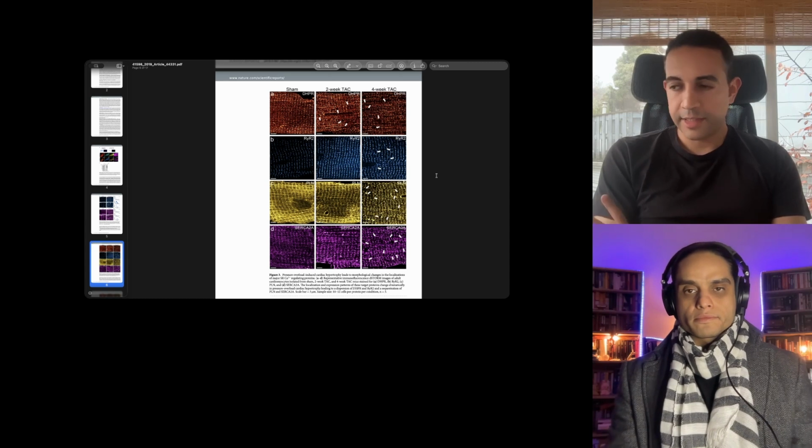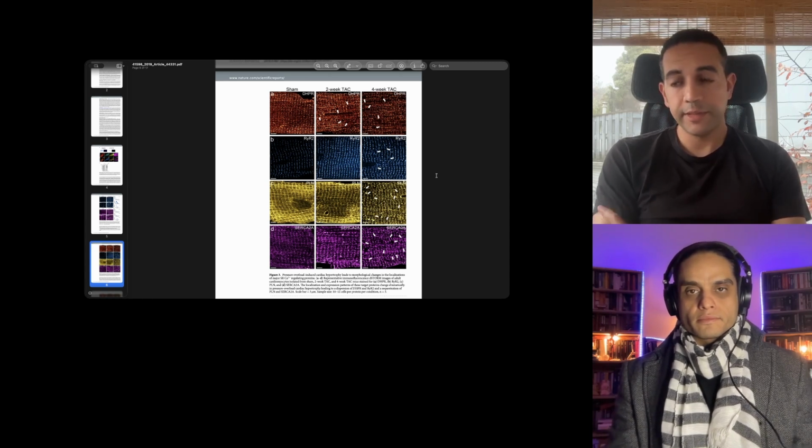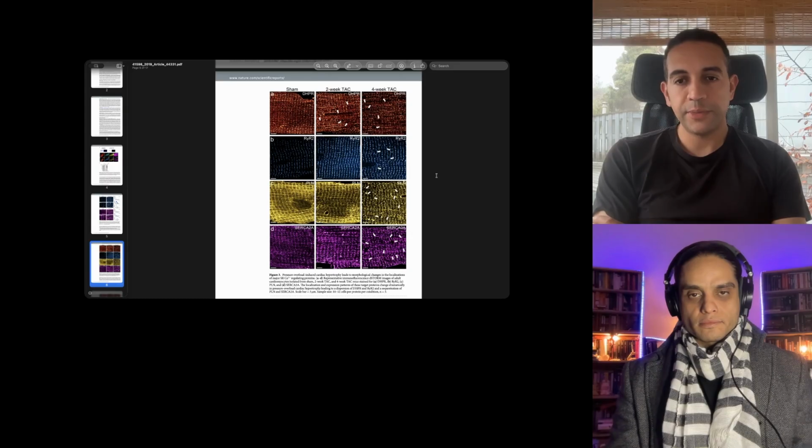And you're repeating the process, and eventually each point becomes enclosed within a polygonal region, and what you're getting is a distribution of median distances for each point relative to all its neighbors. And that allows you, from that distribution, to get a sense of how your points are distributed relative to one another.